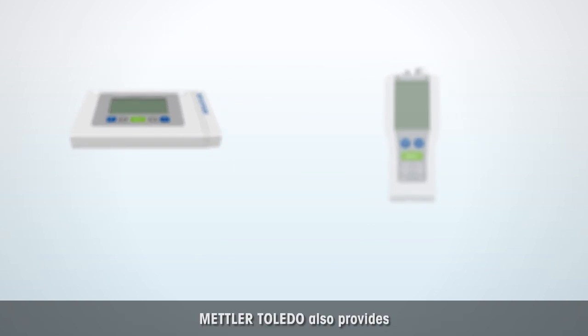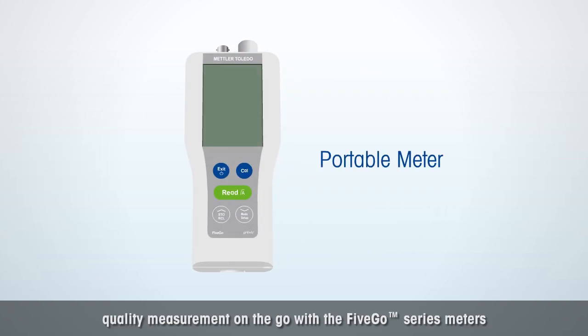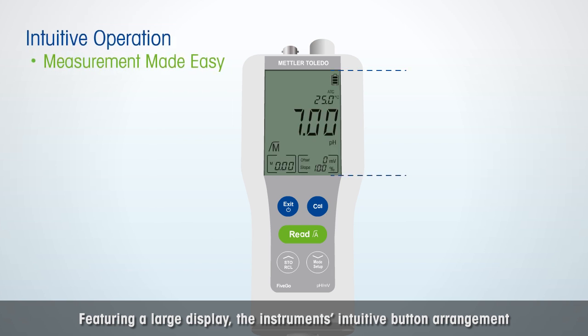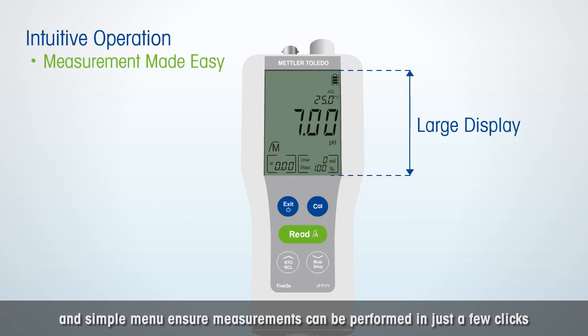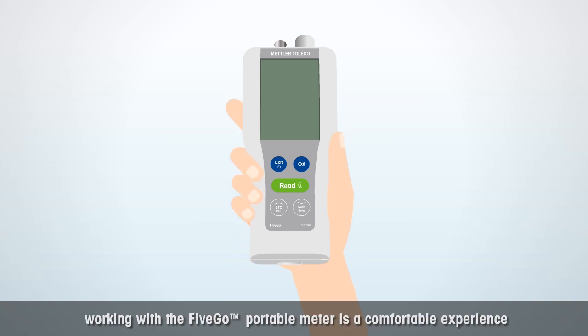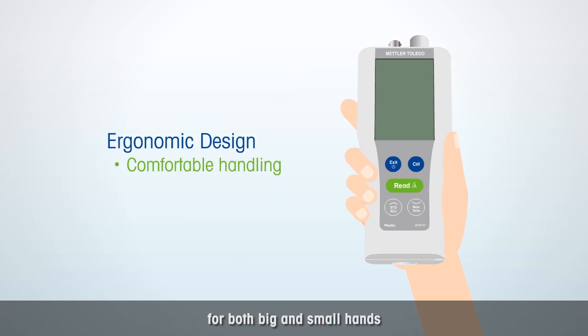Mettler Toledo also provides quality measurement on the go with the 5 Go Series Meters. Featuring a large display, the instrument's intuitive button arrangement and simple menu ensure measurements can be performed in just a few clicks. Thanks to its ergonomic design, working with the 5 Go Portable Meters is a comfortable experience for both big and small hands.